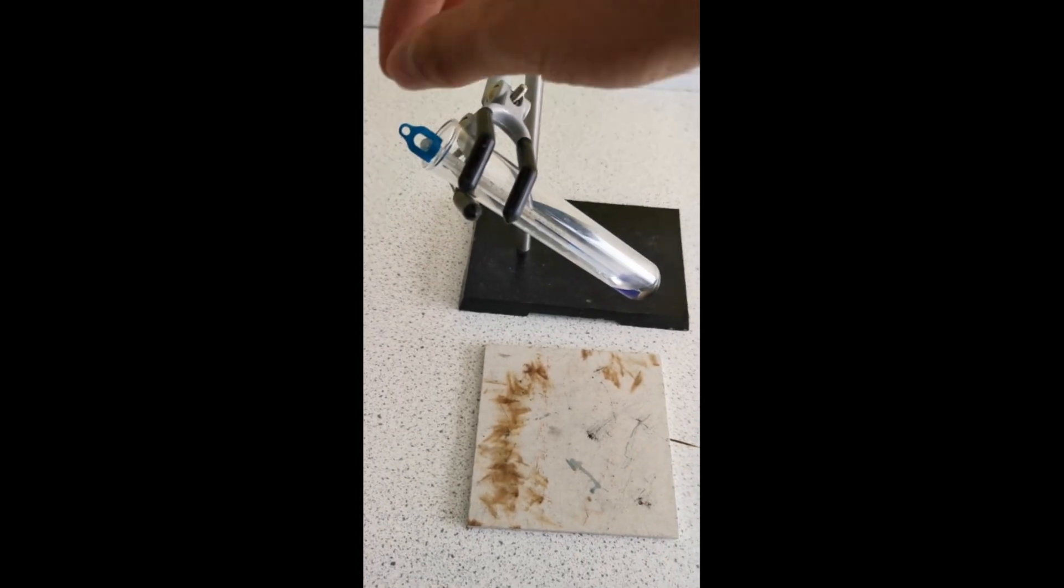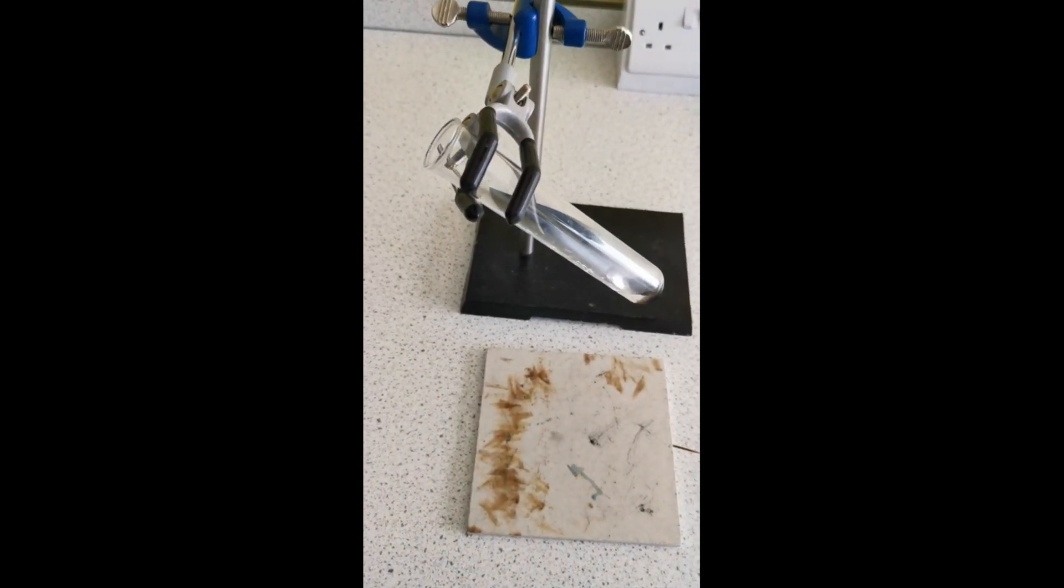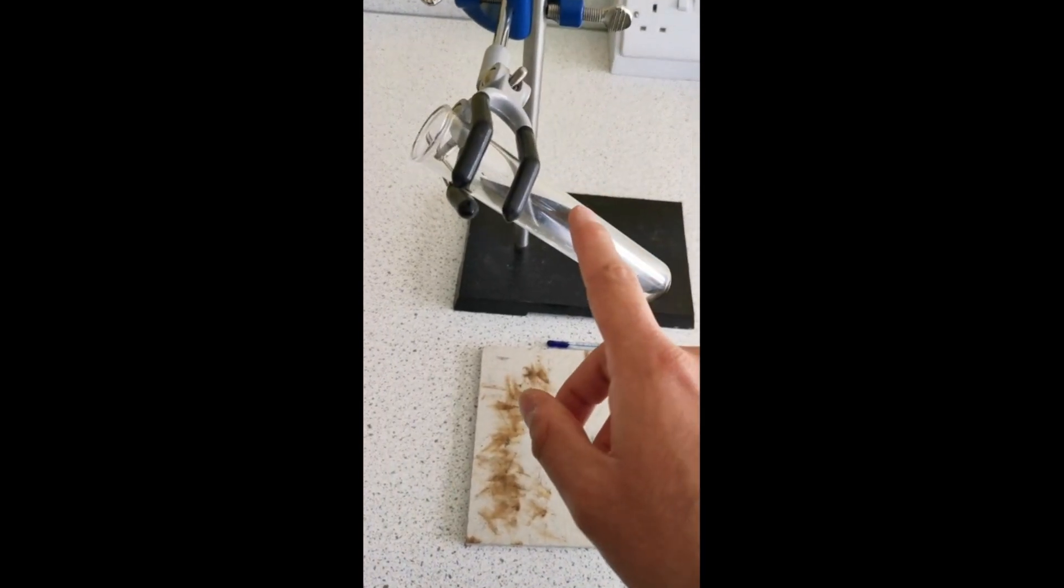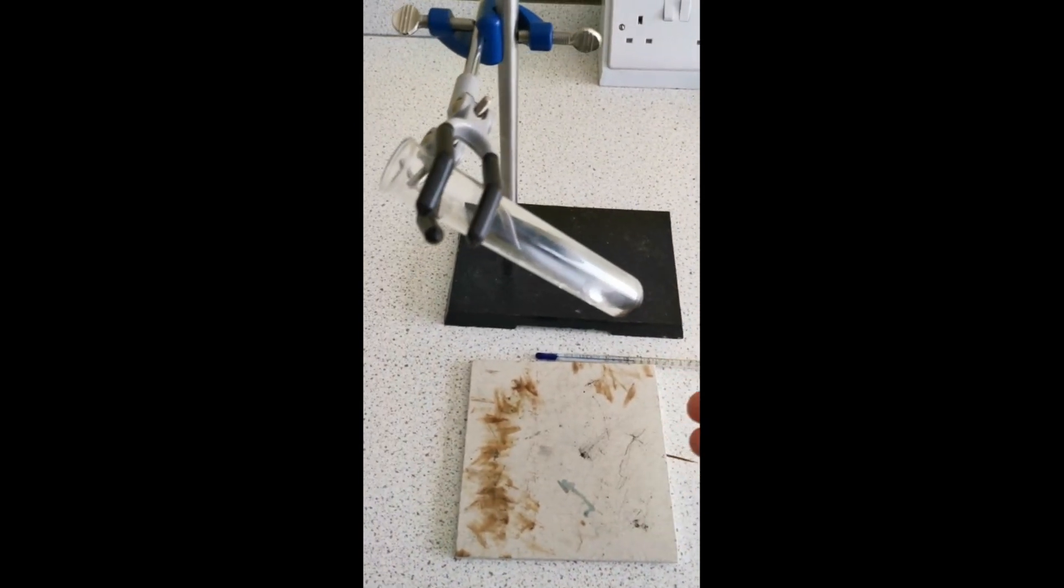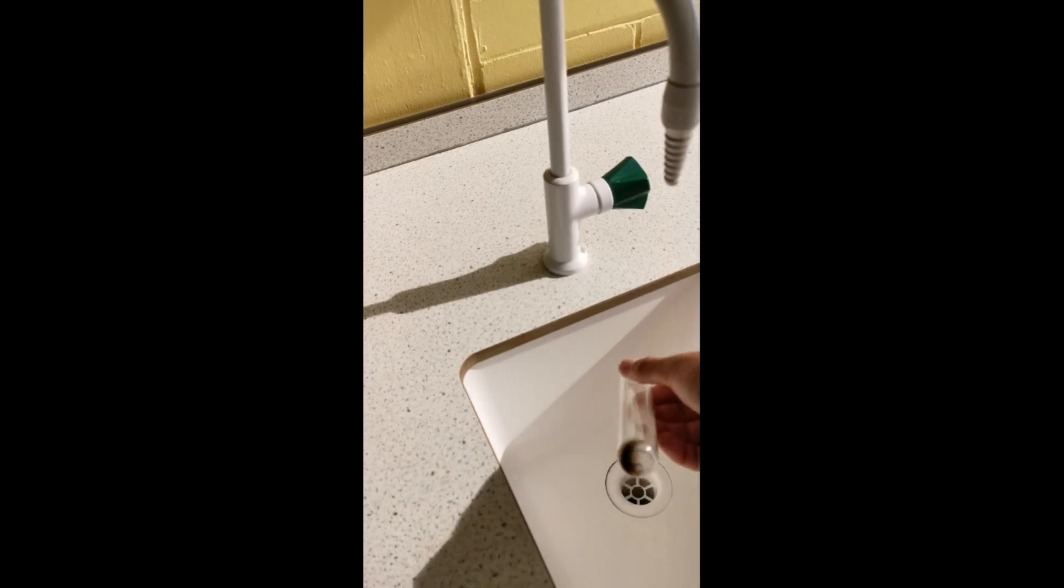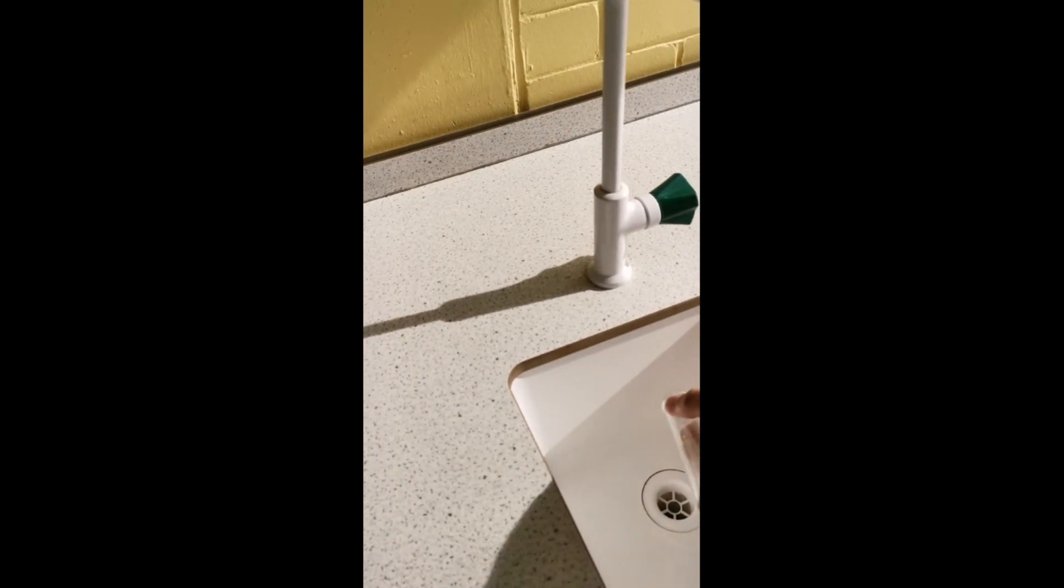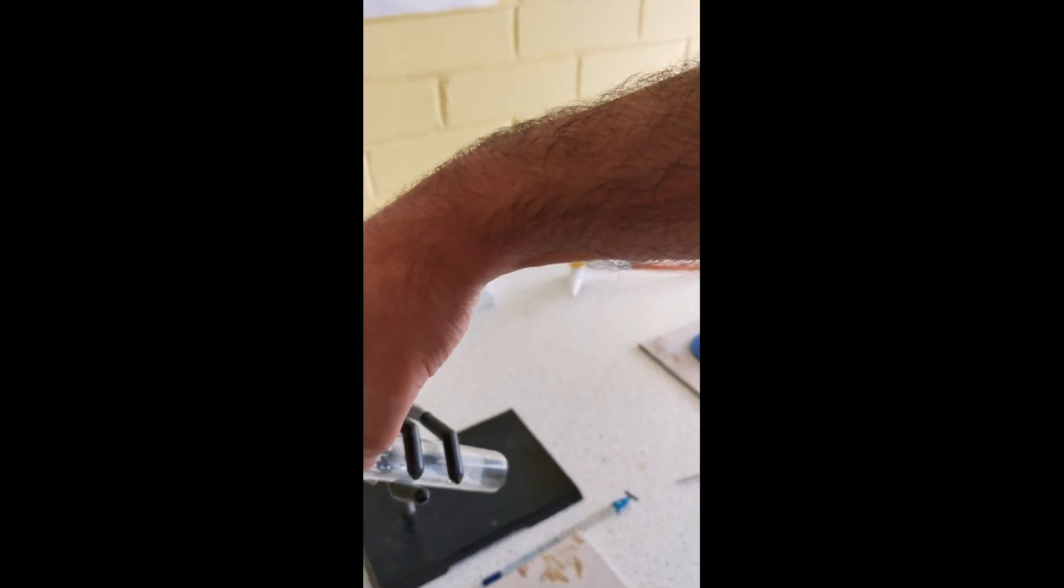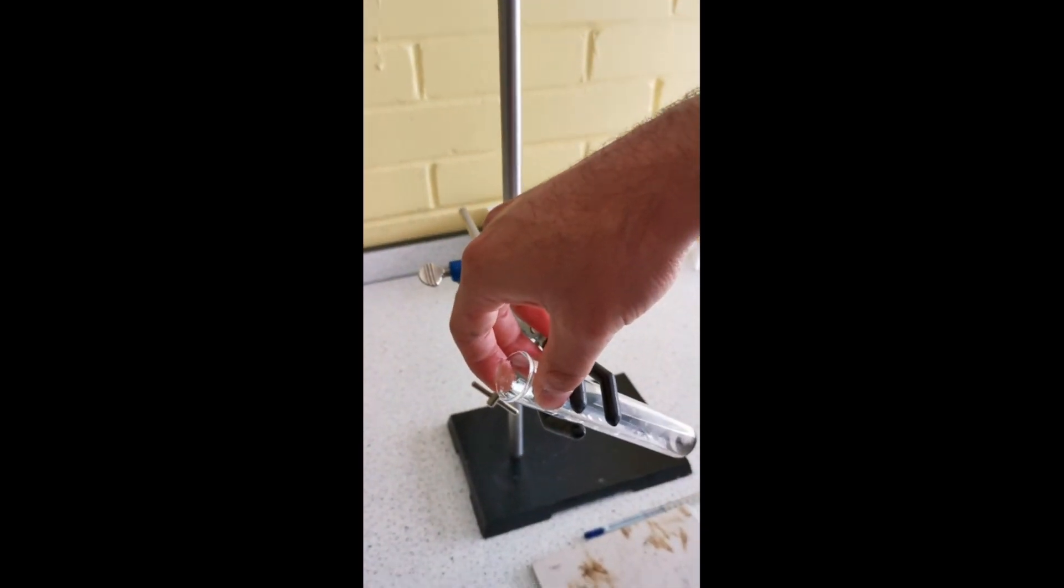Now we're done. We want to take the thermometer out and put it somewhere that it can't roll off the table. We want to change this water. Make sure the boiling tube is not hot, then remove it from the clamp stand, pour the warm water into the sink. Then it's ready to go again because we want to use fresh water each time so it starts at the same temperature.